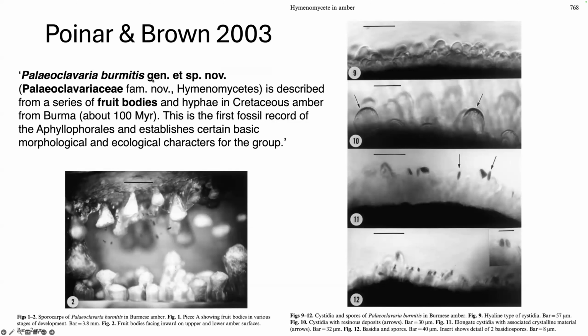And in the spirit of play, I knew that this would make a nice image. So I took that specimen I showed you earlier and stuck it in the X-ray microscope and got images like these. And this thing here, this is a leaf of a dawn redwood. And you can see it just chops all the way through. So there's a cross-cutting relationship. And yeah, these are just two other views. So you can see a narrow neck, and each of them widens out like this.